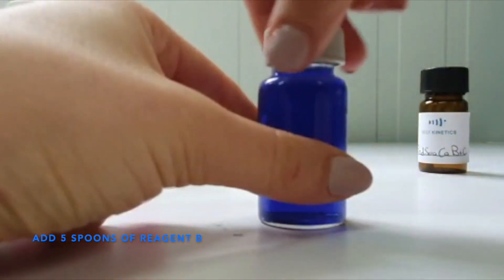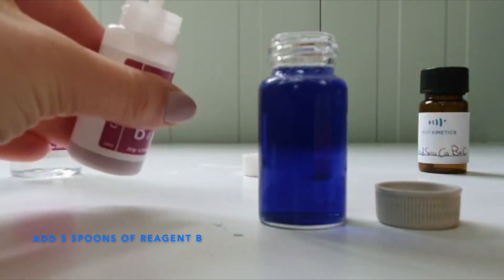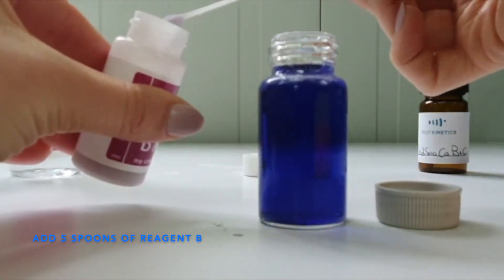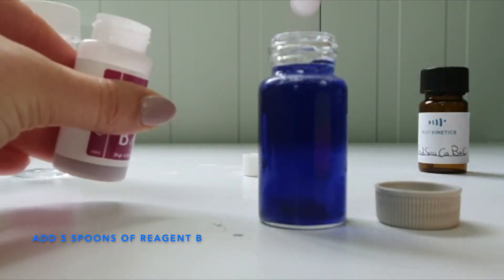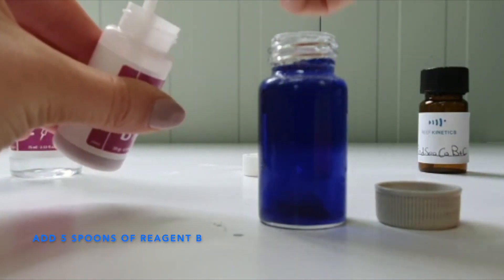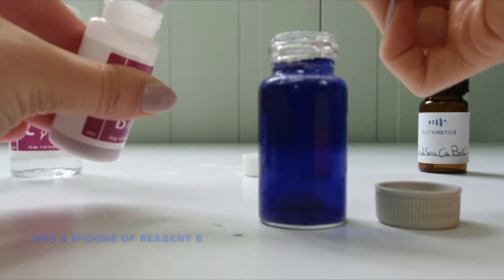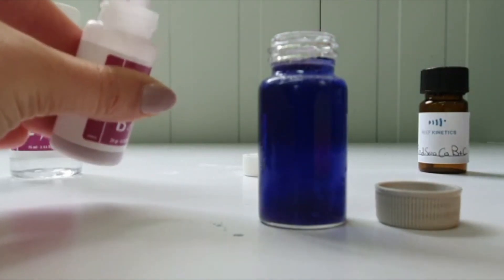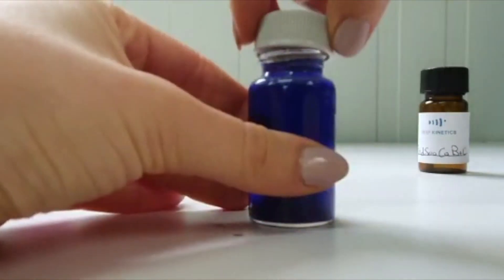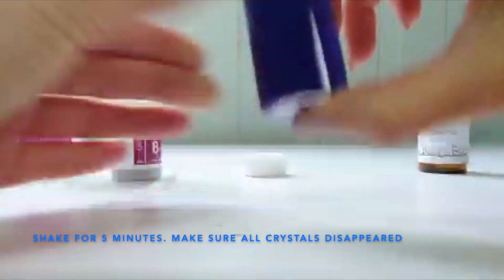Uncap the vial and add another 5 spoons of the powdery agent B. Close the vial and shake very well until you obtain a clear solution.